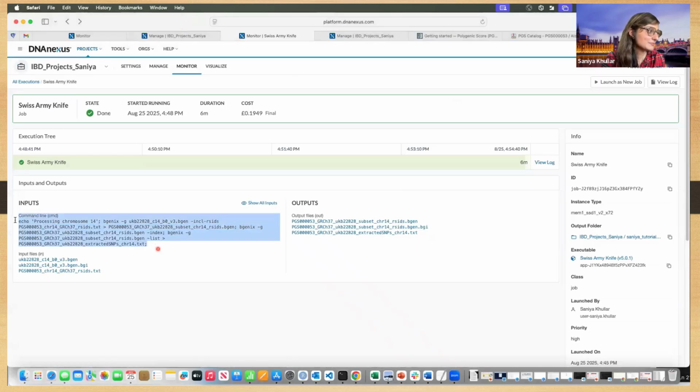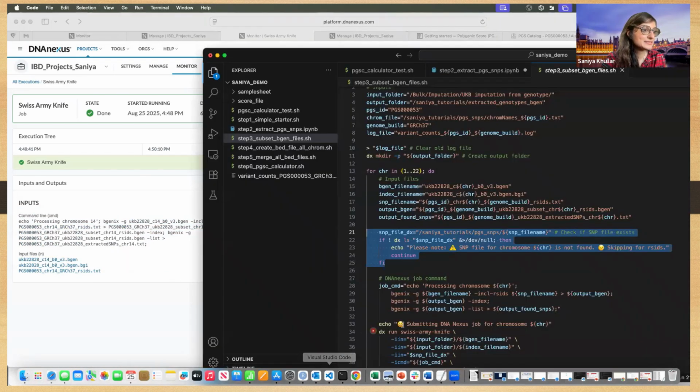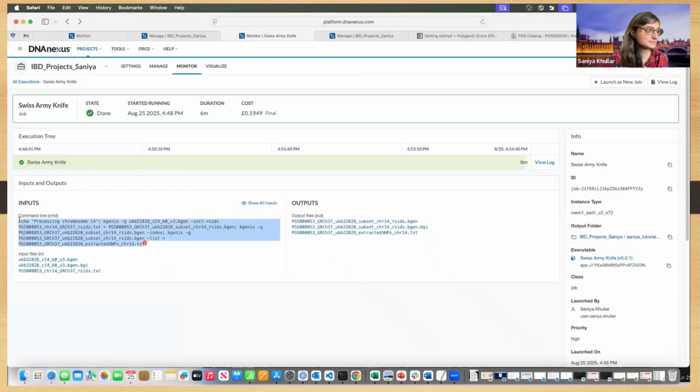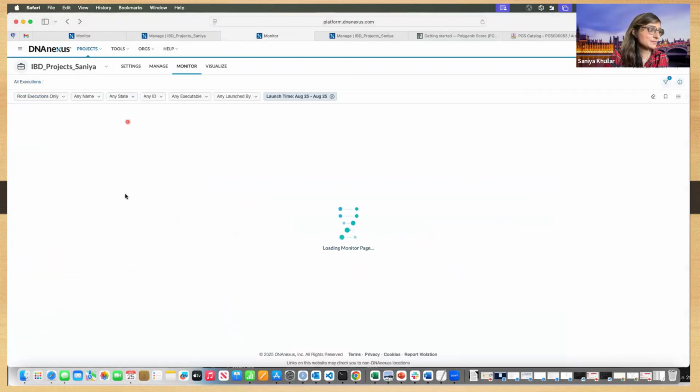And this was the command here again, and it's all using local names. But to upload it, we needed to give those absolute paths in here so that it knows where those files are located. And then going forward, it's just referencing these local file names. That's what this is showing, local file names for this. And this is what is being output. And I'll show you a couple more examples.